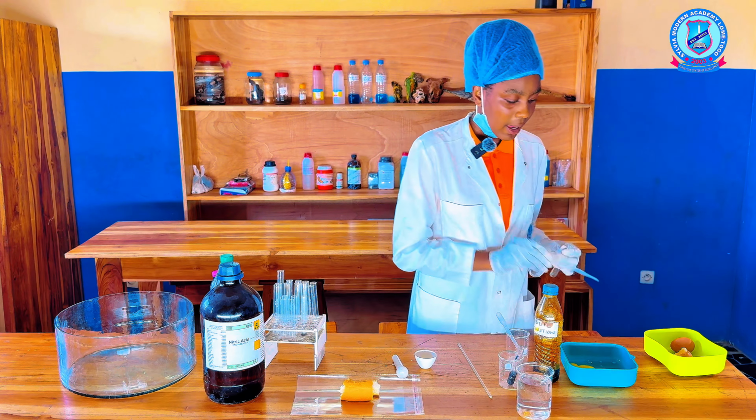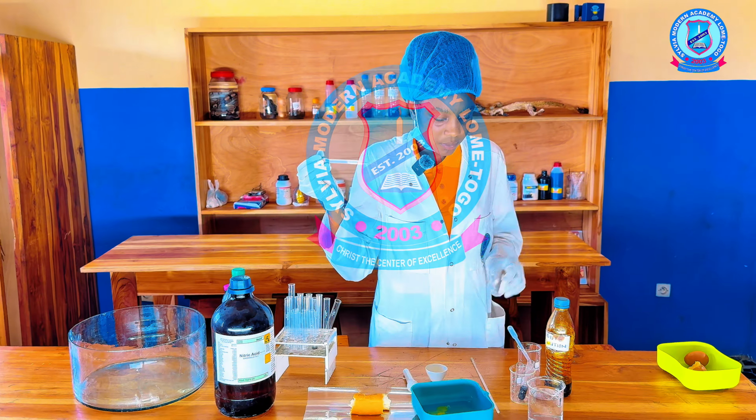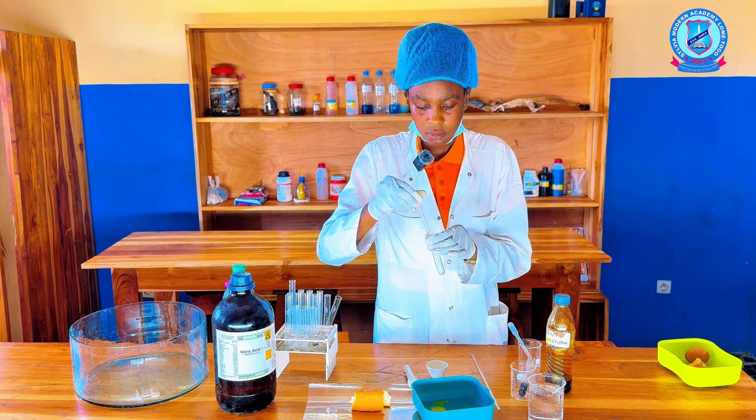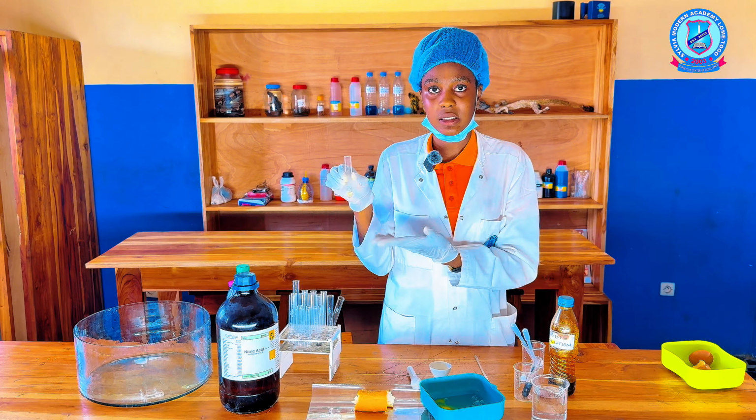I'm going to try it on protein to see whether iodine solution is used to test for protein. We're going to take our egg white. This is our egg white. So we're going to add it into the test tube. So as you can see, the egg white is in the test tube.